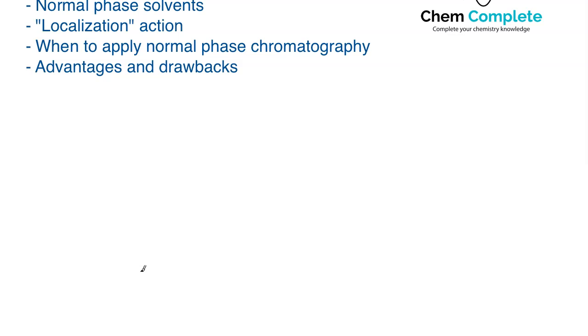If you followed this lecture series so far, you may remember that reverse phase HPLC was one of the first methods that we really talked about after column basics and stuff like that. And so the name here, when it says normal phase HPLC, this setup was originally the HPLC conditions used and developed prior to the development of reverse phase HPLC. So that is the reasoning behind the quote-unquote normal name.